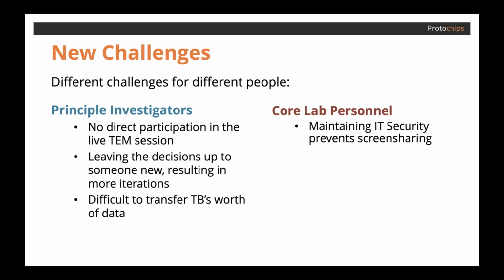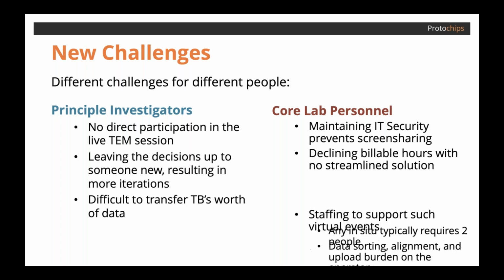Now, the other perspective we're looking at is from the core lab personnel, such as the TEM operator or the lab manager. And for them, it's difficult to sacrifice the TEM safety for screen sharing capabilities, making a streamlined process for remote sharing very difficult to implement. And because of this, billable hours start to decline without a good solution. And this could lead to things like personnel or equipment sacrifices as well.